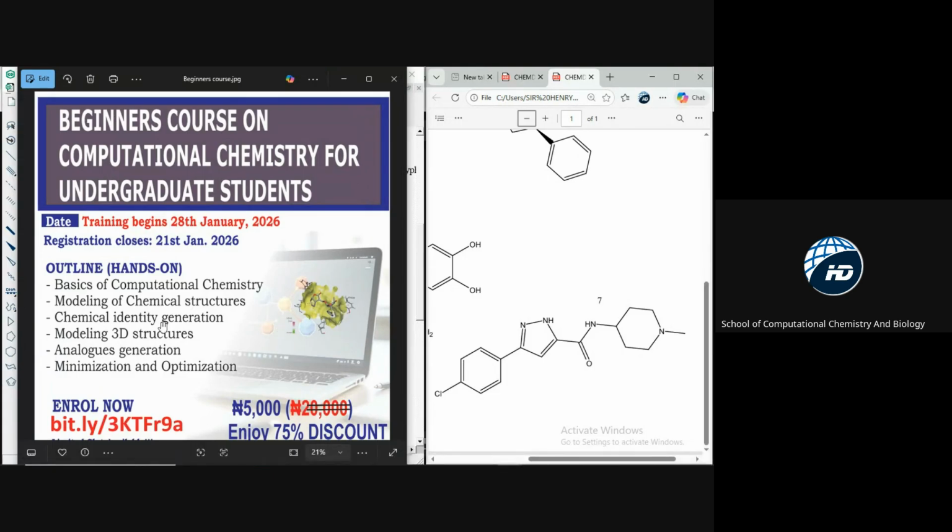So after we were able to draw the second file, we should now look at 3D modeling.